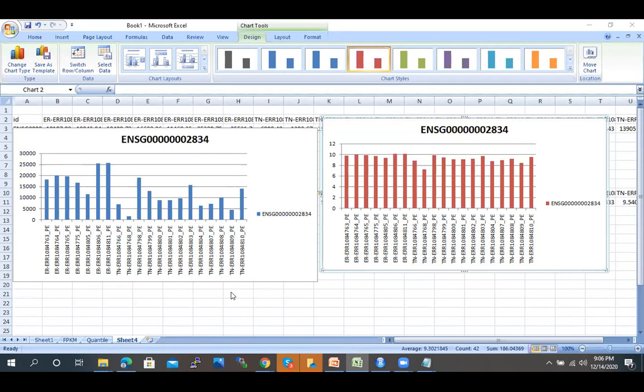Next, we will see how we can upload this data, visualize our data and perform log scale transformation in R or Python. Today we are going to demonstrate first how we can load data in R, then do various types of manipulations on our data, and then visualize our data using box plot, bar plot, or scatter plot.